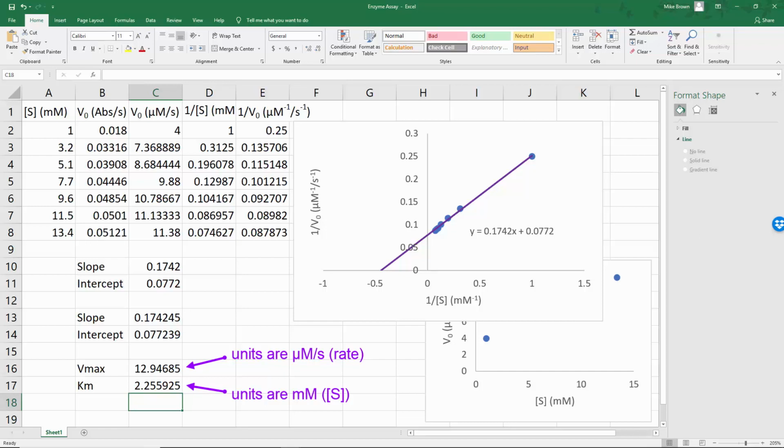There are some issues with getting Km and Vmax using the Lineweaver-Burk approach. Using the reciprocals can increase the effect of small measurement errors. Also, the analysis emphasizes the smaller substrate concentrations over larger ones. When you design your own experiment, you may want to use different substrate concentrations so that the reciprocals are more evenly spaced. Now, even though we set up 7 reactions to get this data, we have not performed 7 replicates.